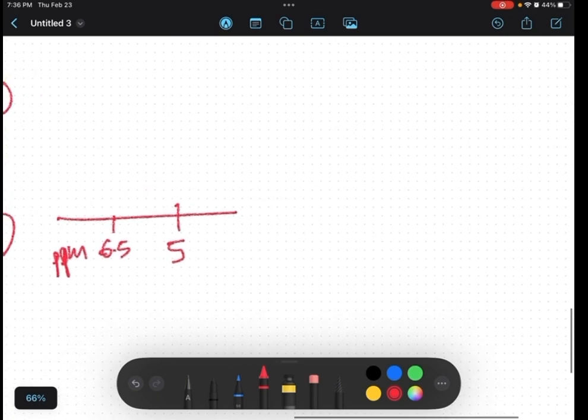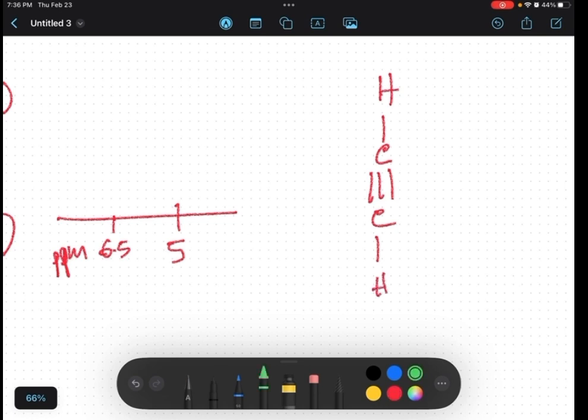And in the same way for the alkyne type proton, if you give the magnetic field, it normally goes through the bond and also aligns with this proton. Ultimately that proton is not activated. If the proton were outside this magnetic direction, then it could be more activated, but now it is aligning with the same direction, so that's why it is not activated. So alkyne type protons are normally more shielded, so that's why they show up near 1 to 4 or something.